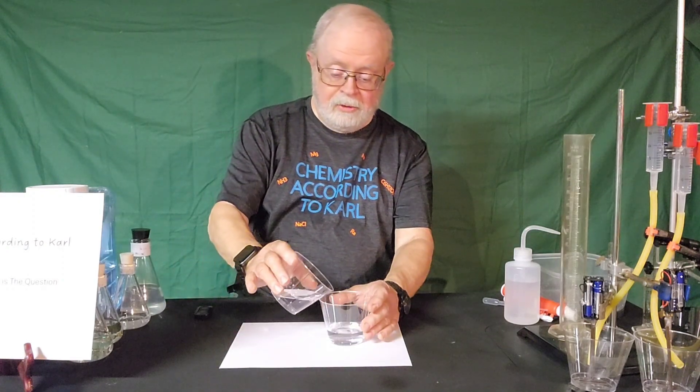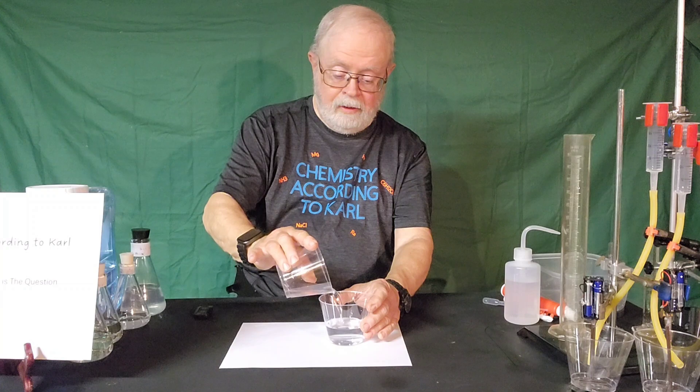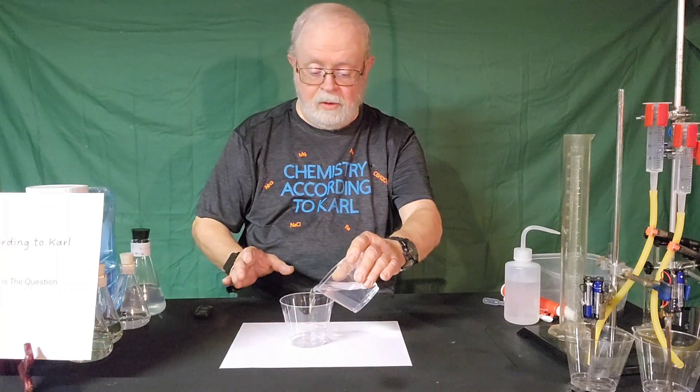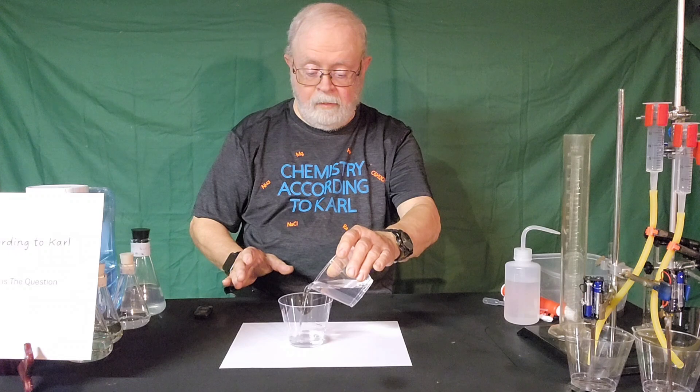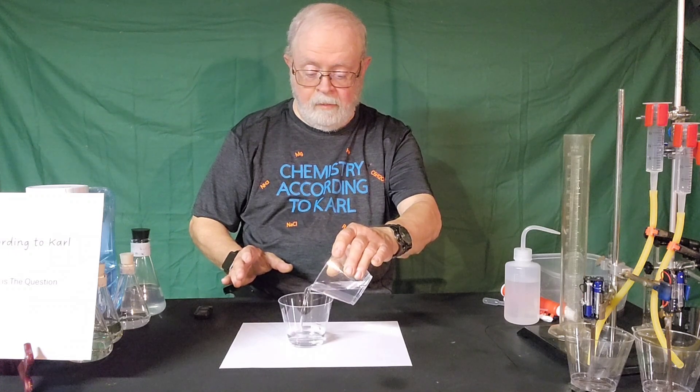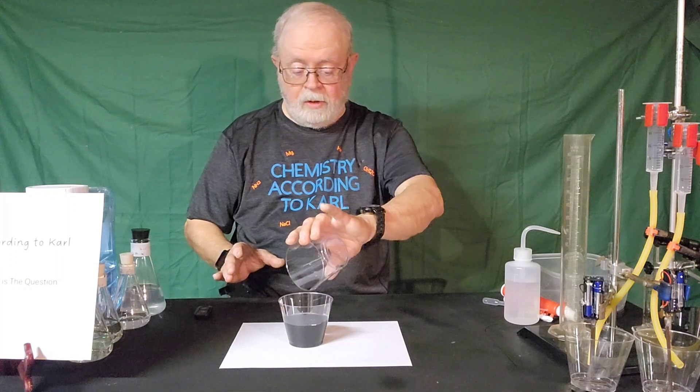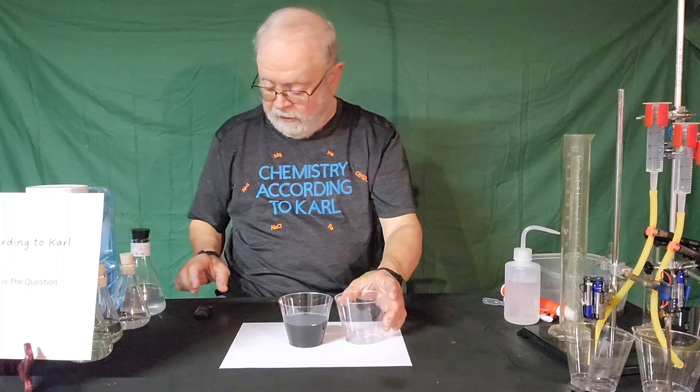We'll start putting the two containers together here, and we'll be looking for something to happen as we do this. And there it was. That worked pretty well. I'd have to give that a thumbs up.